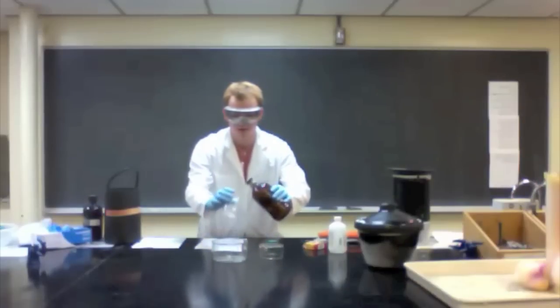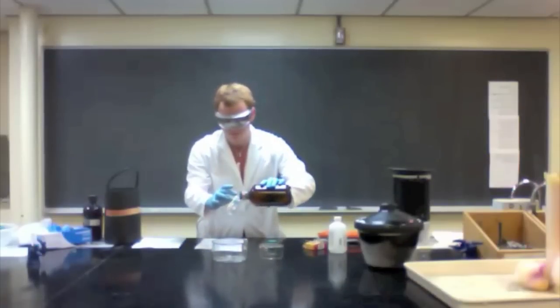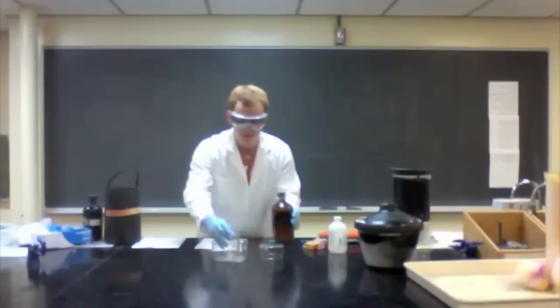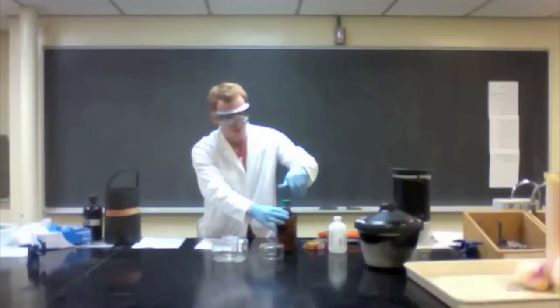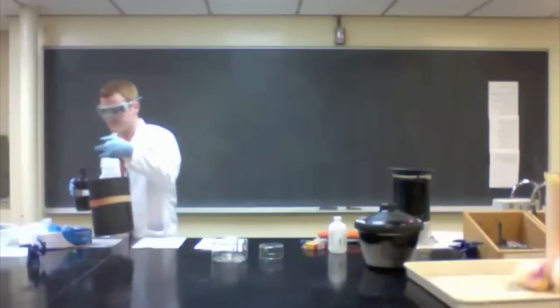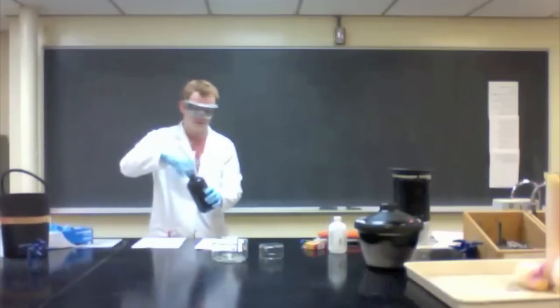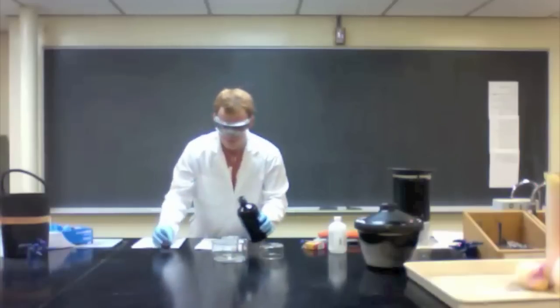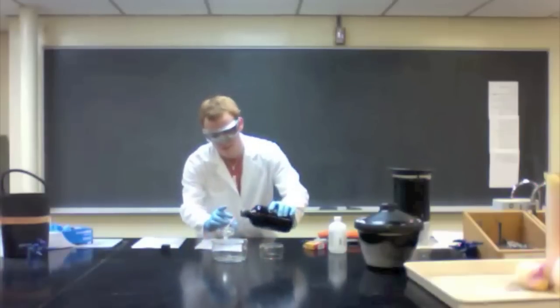This is hexanediamine and sodium hydroxide. I'm going to lay it on the bottom here. And on top of this, I'm going to put a solution of sebacoyl chloride and hexane. And at the interface between the two, because they are different densities, one is going to float on top of the other.